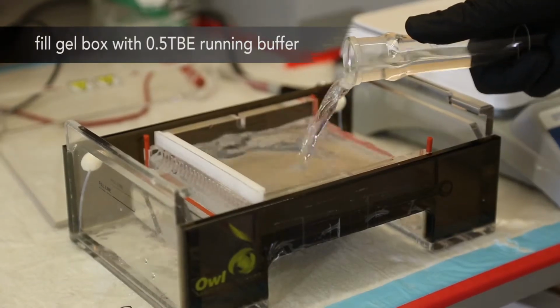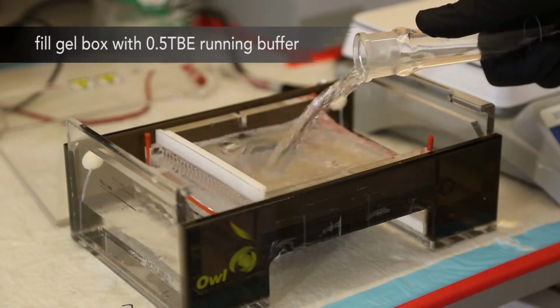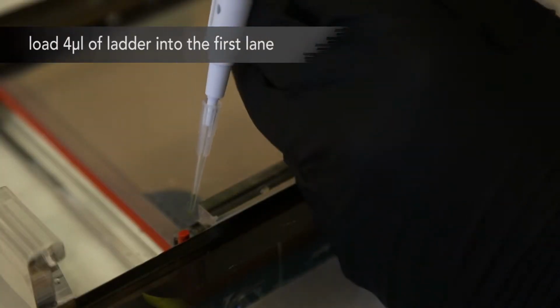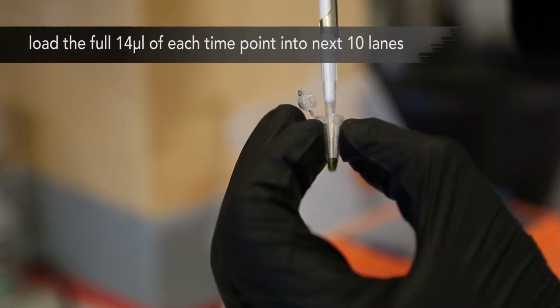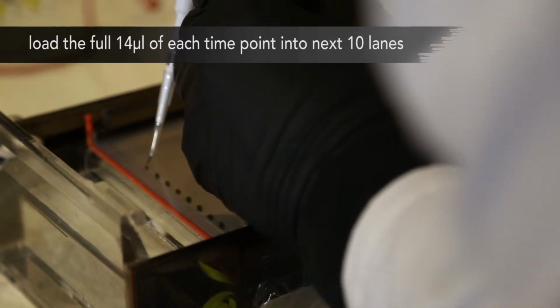Fill the gel box with the 0.5x TBE running buffer to the fill line. Again, remember to use the same buffer used in casting the gel. Load 4 microliters of ladder into the first lane. Load the full 14 microliters of each of the time points into the next 10 lanes.